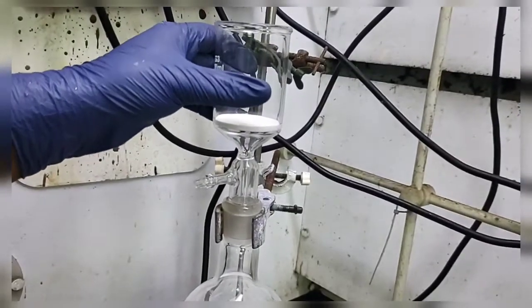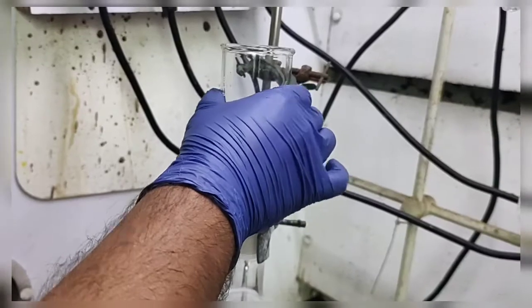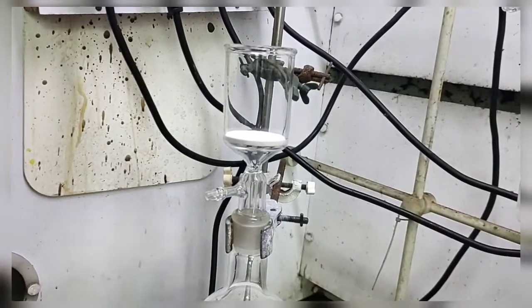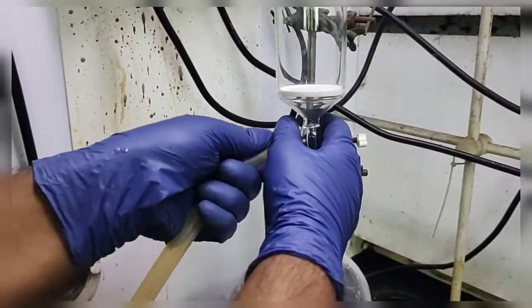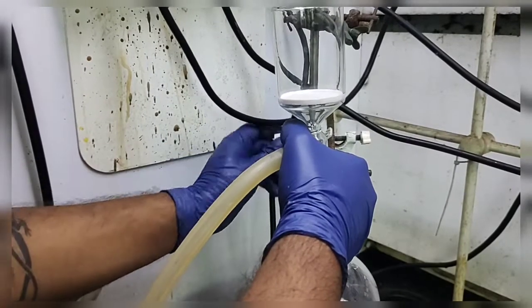Now we will fix this sintered funnel in this round bottom flask and to it we will attach a vacuum pressure pump.